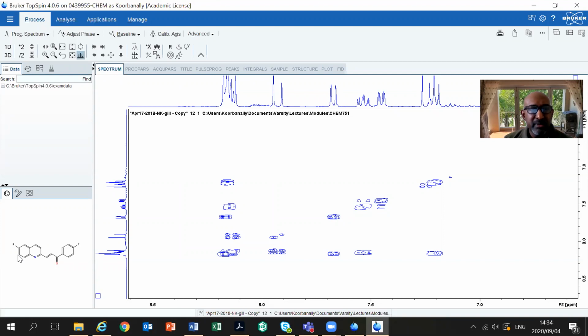And then I'm going to jump to this hydrogen, right? So this double doublet here, I can tentatively assign, and I say tentatively because I need to find maybe a little bit more proof of that. The more evidence I can provide, the better it is, right? I'm going to jump to this proton here, and let's see what I get.